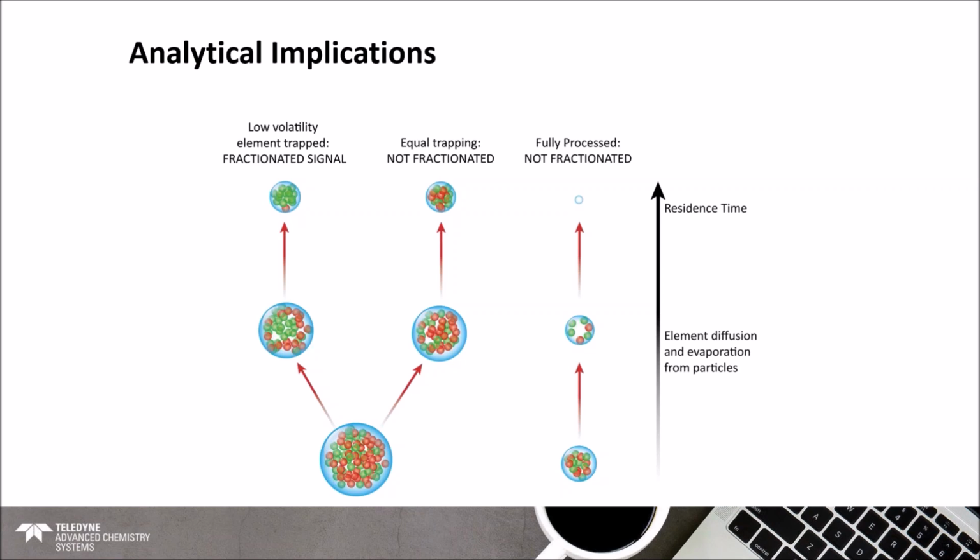Our goal is that we would like the elemental composition to be well distributed throughout, so you don't end up with trapped particles, which can lead to a poor representation. If we have the smallest particles possible, then that becomes much harder to do, and you end up with a more representative sample.